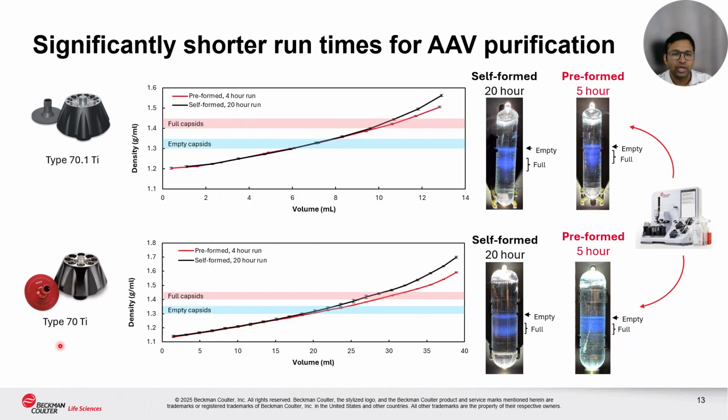So after ultracentrifugation, the homogeneous cesium chloride solution will form a linear gradient after 20 hours, with some curvature towards the bottom of the tube, a certain nonlinearity, which is typical of cesium chloride gradients if you refer to our rotor manuals.